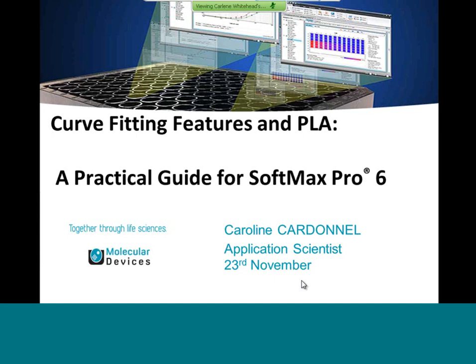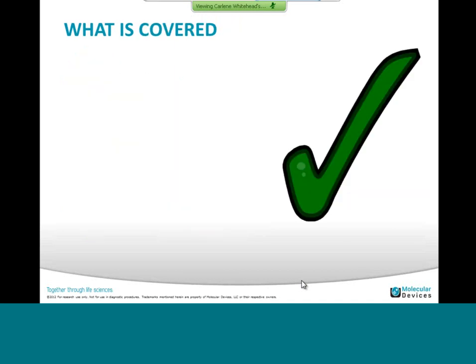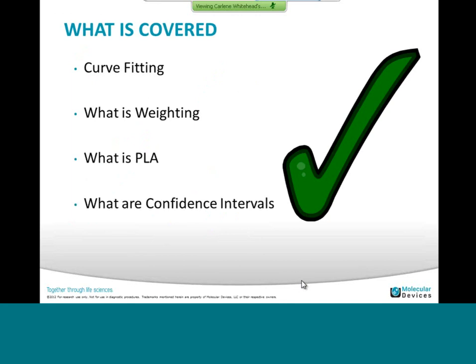So today's talk will be on curve fitting features and PLA as a practical guide in SoftMax Pro 6. As I'm not a statistician or mathematician, we will not cover the theory, the formulas, or high-level stats. But today we'll cover curve fitting, what is weighting, what is PLA, and what are confidence intervals. For the first three topics, we'll also review some protocols that have been written in SoftMax Pro to help you choose the best curve fit, the best weighting factor, and to determine if the curves are parallel.